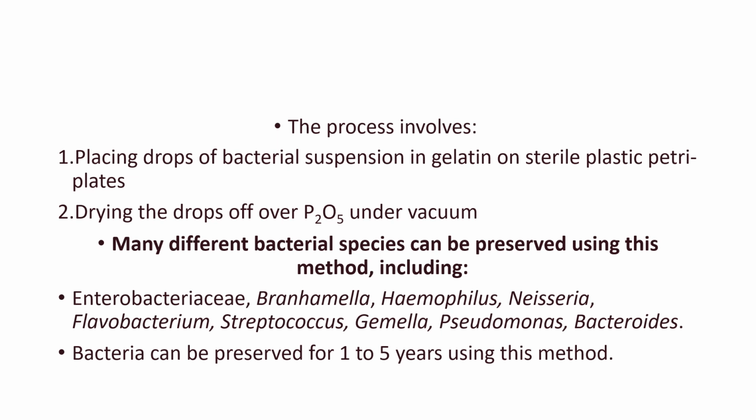This is the protocol for the gelatin disc method. First, we will place the bacterial suspension drop on gelatin on a sterile Petri plate. Then we will dry the drop over phosphorus pentoxide under vacuum. Phosphorus pentoxide is a white crystalline compound and it has a dehydrating property.